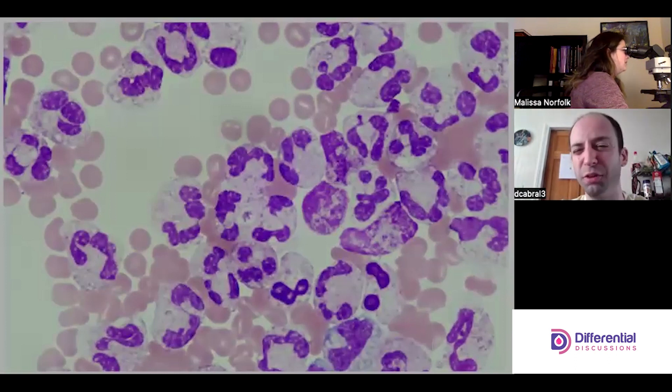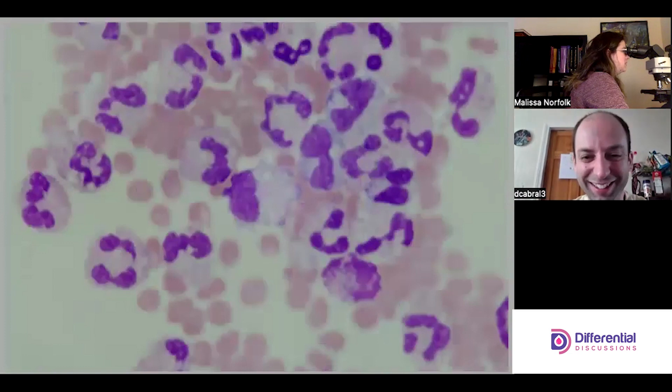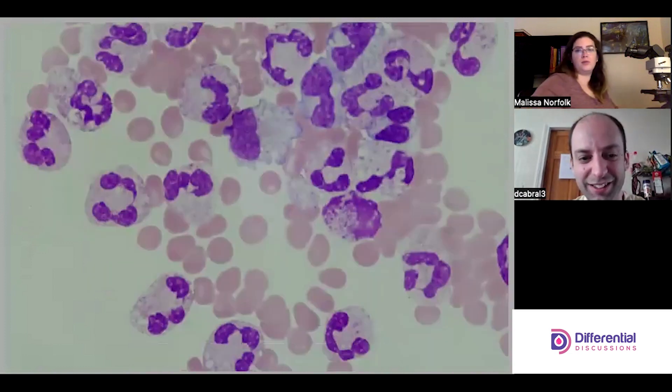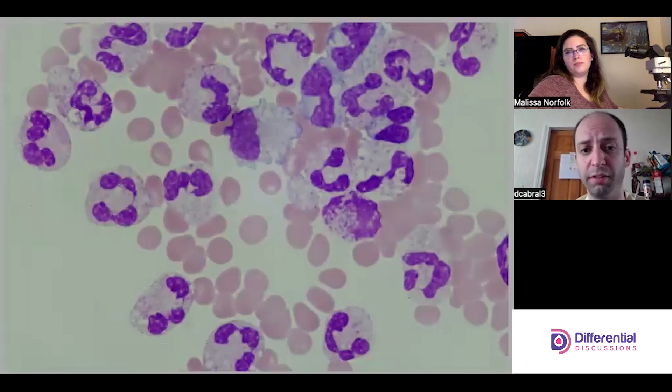I've seen crystals in lymphocytes too, very rarely. We verified the presence of crystals, but that does not necessarily exclude infection either. We should still be vigilant in looking for bacteria and yeast.